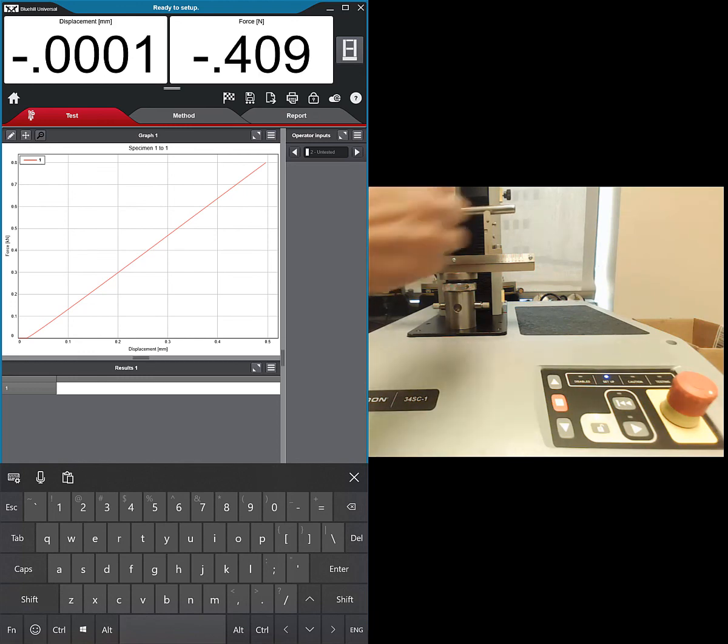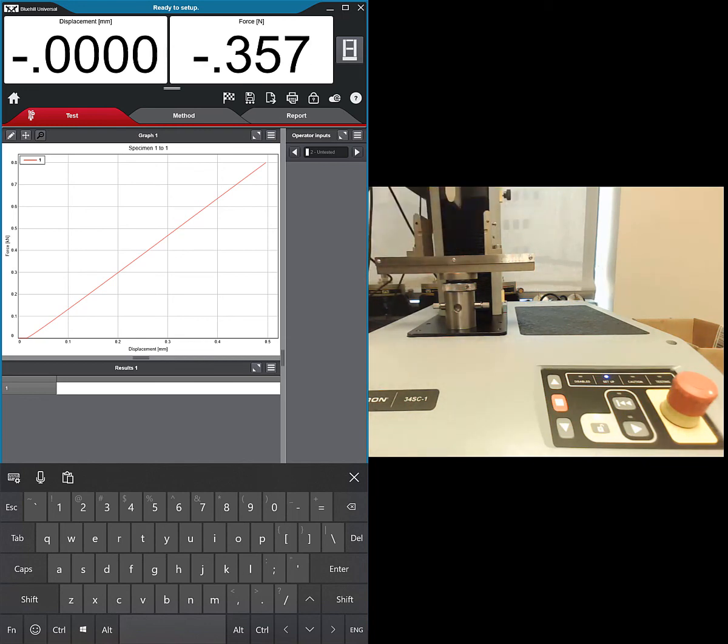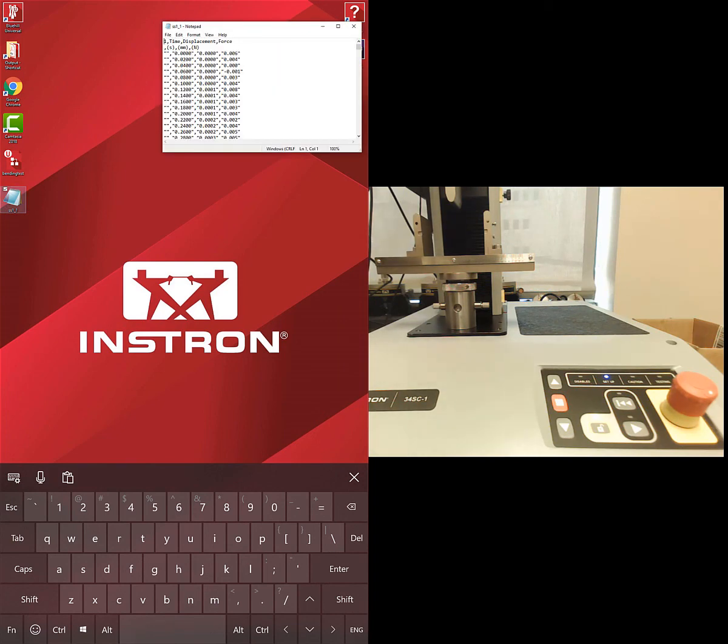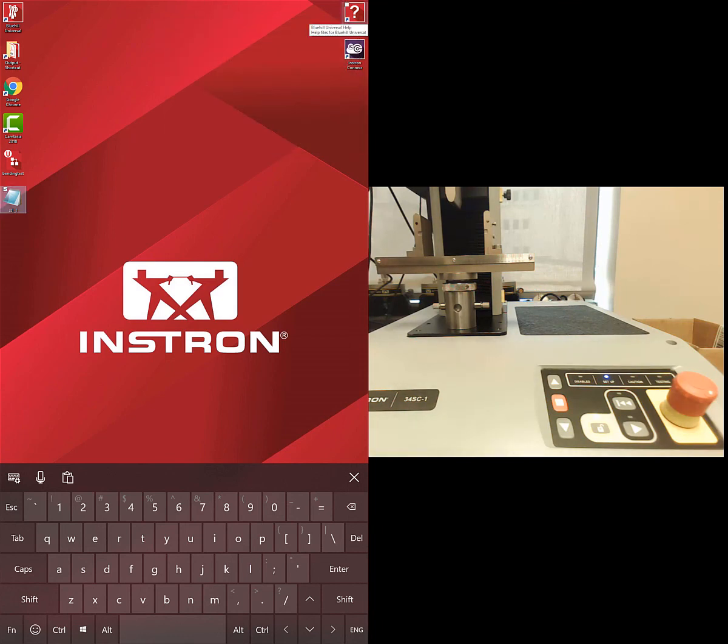We've run that material. You could rerun it or move to the next material. On the desktop we have our CSV output with time, displacement, and force in three columns. Excel isn't on this machine so it opens in Notepad, but you can upload the CSV to Google Drive or Box and do the analysis later.